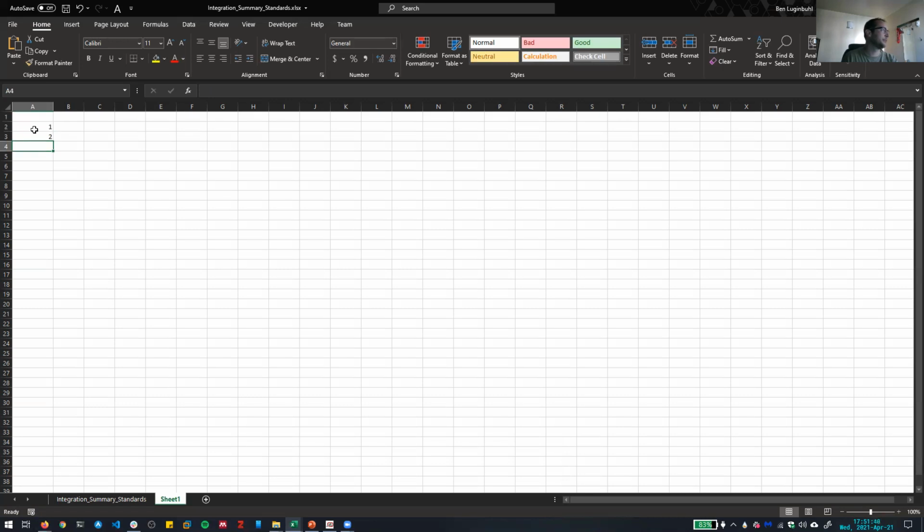So we want to do sample 1, sample 2, sample 3. This is going to be MTBE. This is going to be toluene, benzene, and we also have our 1-chlorohexadecane, CHD we'll call it. We can calculate the D8 toluene later because that should be the same for all of them. So now I'm just going to go through and fill in the microliters that we add for each of these. 50, 20, 10.